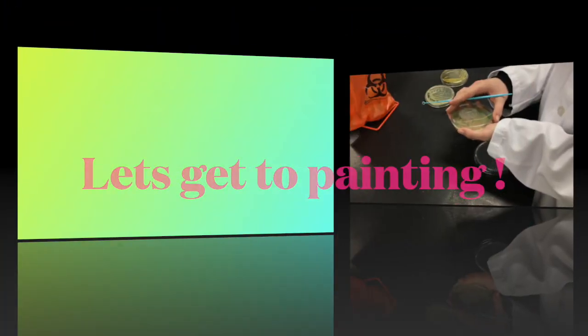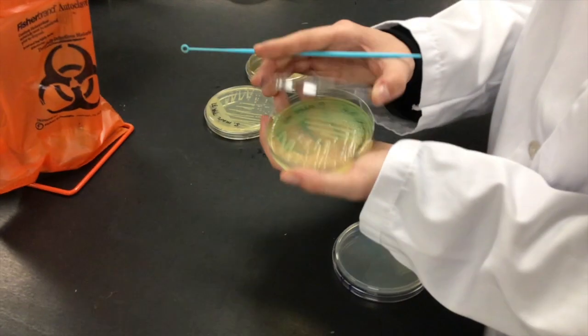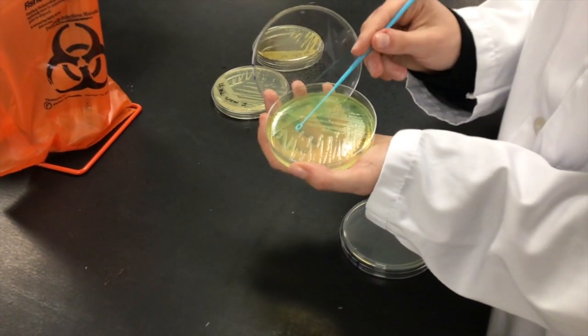Well, Megan, now that we're all good and familiar with microbial art, what it is, and what we're going to be using, we can begin creating our living art pieces. We'll be looking towards the American Society of Microbiology for a guide for our tutorial. So we already have our prepared agar, and our colonies are ready to be inoculated.